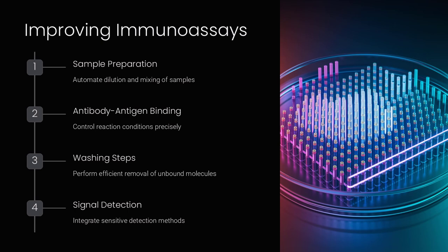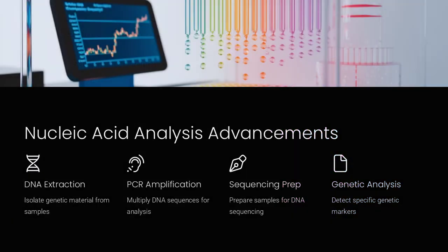Researchers are actively working on developing coatings and improved electrode designs to reduce droplet evaporation and prevent fouling, thereby enhancing the long-term reliability of the devices. It's like refining a high-tech car. Even though it performs exceptionally well, engineers must continually work on reducing wear and tear on its components to ensure it remains reliable over long journeys.